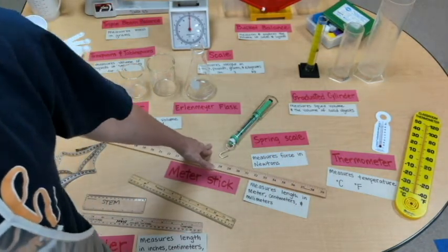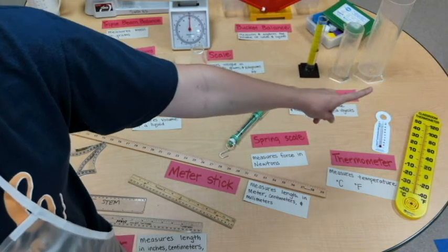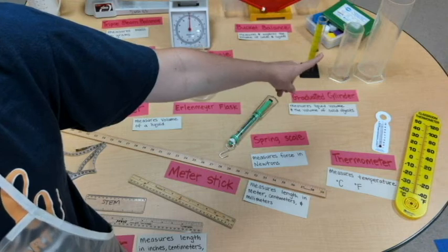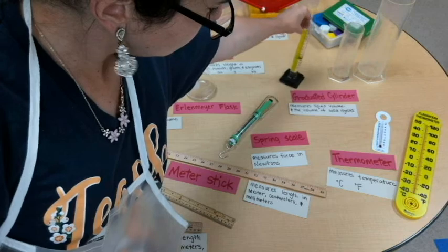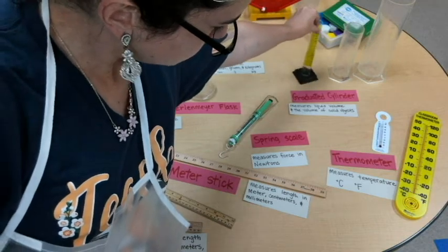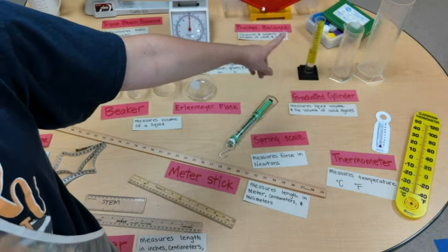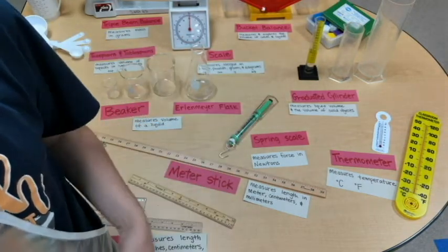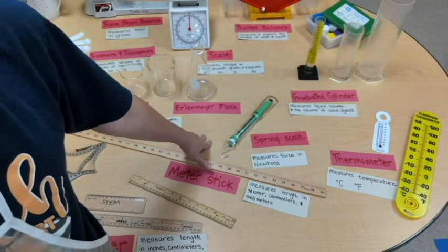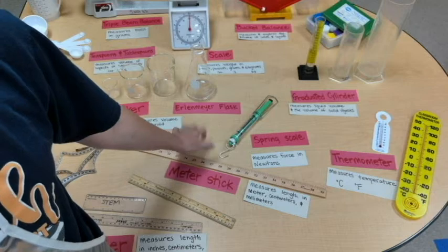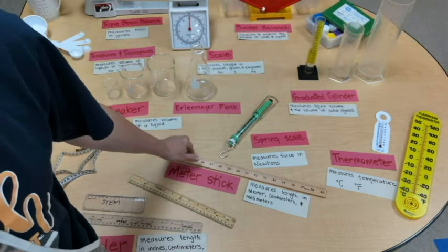And then we have our graduated cylinders back here. We have a huge, tall one. And then kind of a medium-sized, clear one. And then we have this graduated cylinder, which is kind of the same height, but a lot thinner. And you're going to get a lot more accurate readings when you're trying to measure the volume of liquids, or even when you're doing your calculations of measuring the volume of solid objects.